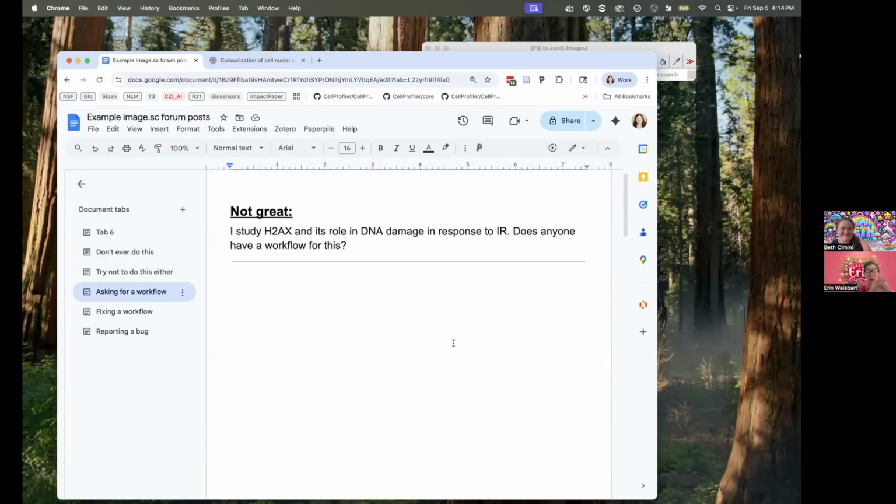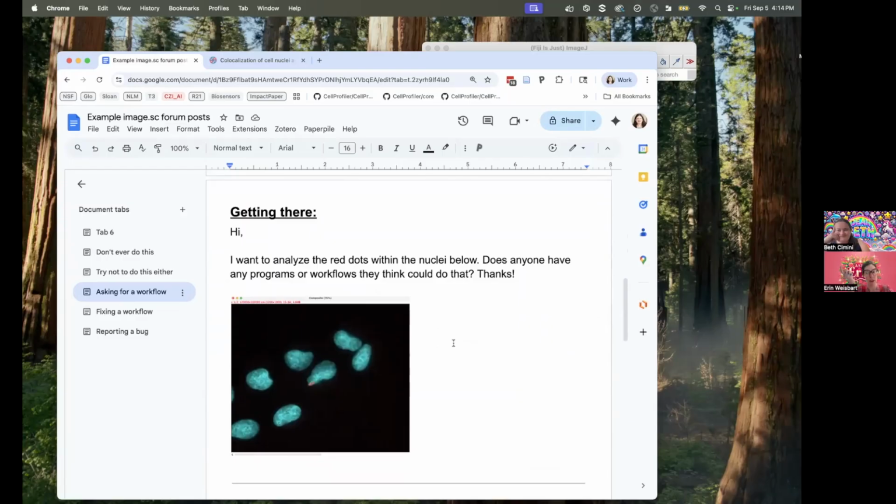Yeah. And we talked about finding spots in images in another Ask Erin, Dear Beth episode, the sparkle episode, as I like to call it. There we had similar themes, in that it doesn't really matter what your spot is. It could be a telomere, it could be a DNA barcode, it could be a peroxisome. None of that really matters. It's the same principles of, I want to find a small punctate object in an image. So all sparkles are special, is what you're telling me? Absolutely. This is a great example of that.